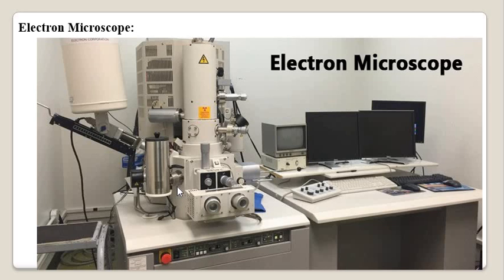Then after that, the microscope column is there. It consists of an evacuated metal tube, because it is going to pass the electrons, short wavelength electrons. So it is a metal evacuated tube, and it is fixed at the bottom and at the top of the electron gun. So the tube is fixed at the bottom as well as at the top.